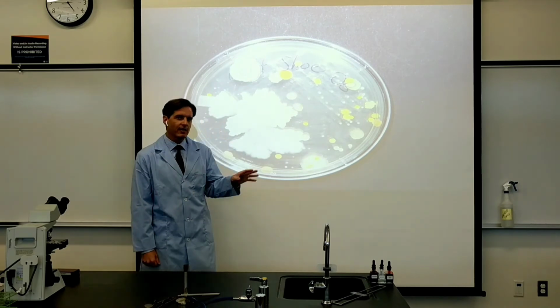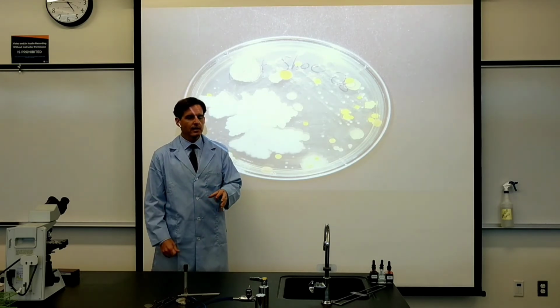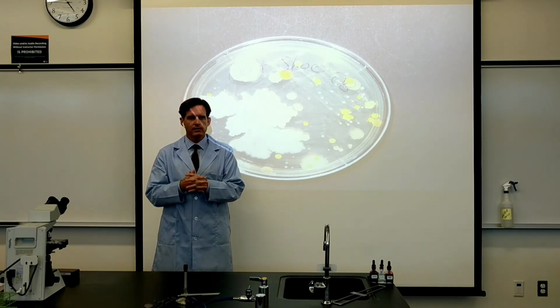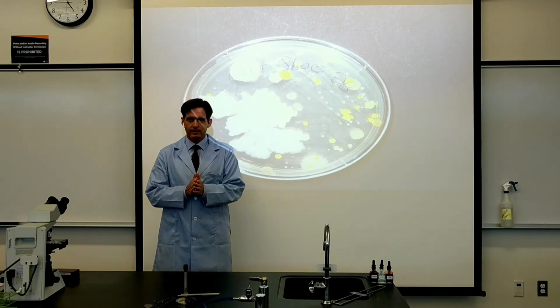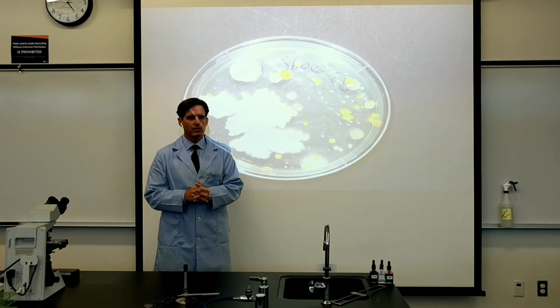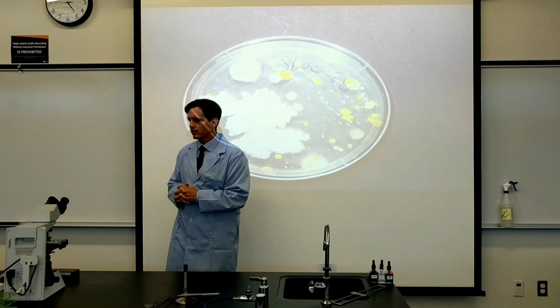Now, how are you going to identify fungi? Most of what's on here is still bacterial, but the reason I'm judging it that way is based on colony appearance as being smooth and mostly shiny and reflective, or even mucousy looking, and very regular in appearance for the most part. Fungi tend to be fuzzy looking. Fuzzy if they're molds. And so molds have these elements called hyphae that grow up into the air, and we're going to do a fungi lab later on to take a closer look.